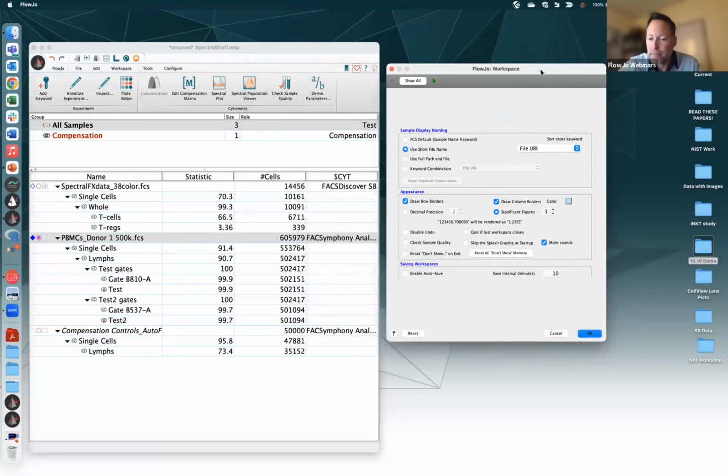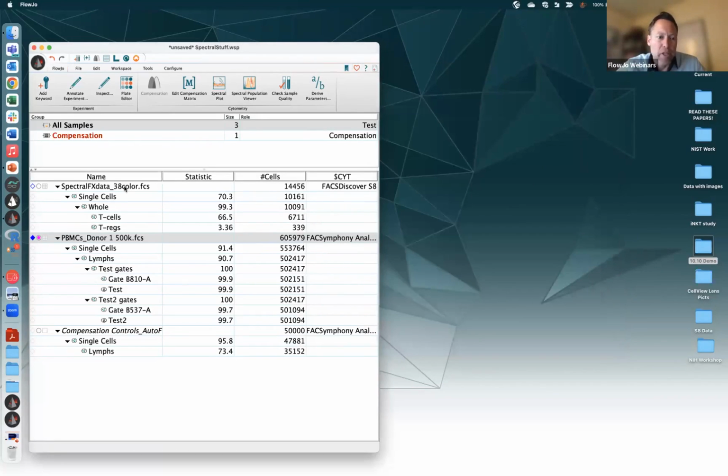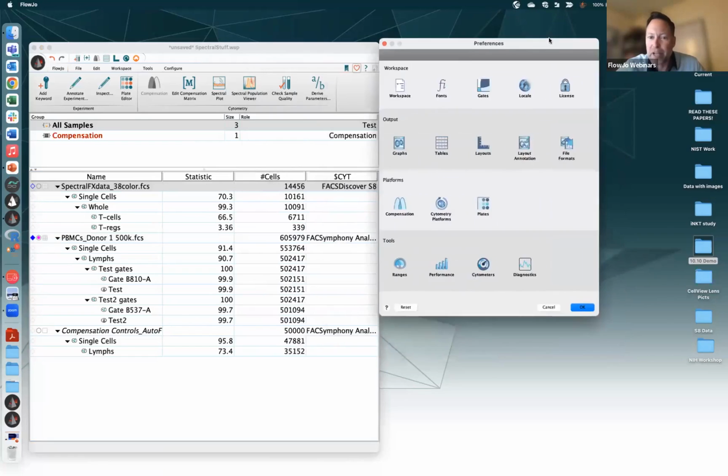All right. Going back to show all. Hey, we were heading here next anyway. On my list of things to make sure I showed you: advanced scaling parameters. Let me click on this file, because that is off the S8, and so that'll have a bunch of fun extra parameters.